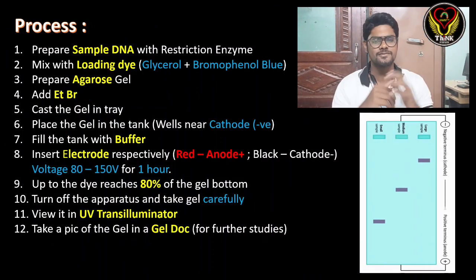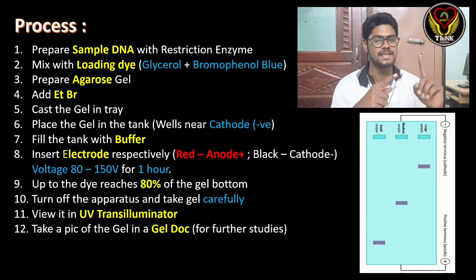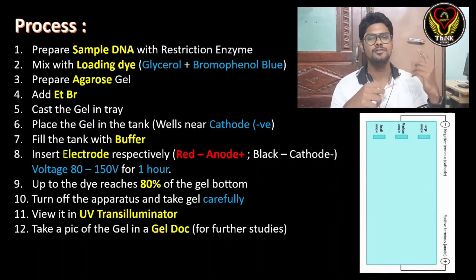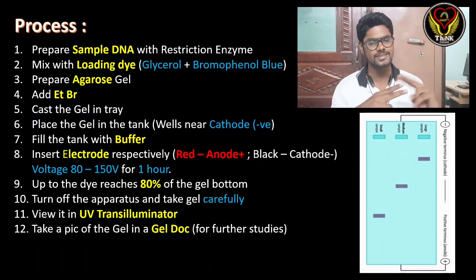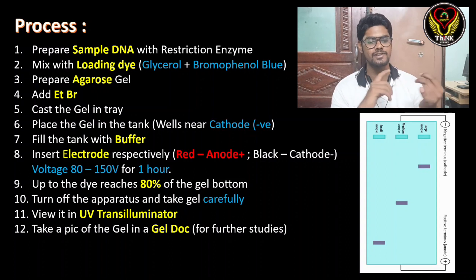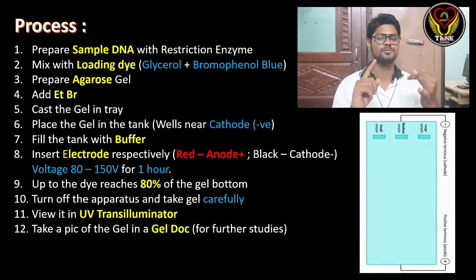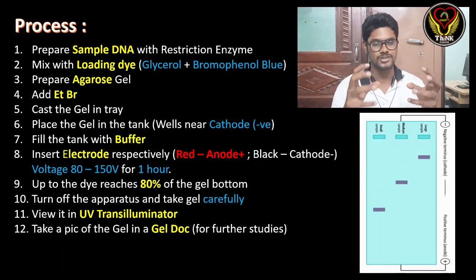So coming to the procedure of this technique, we can separate it into 12 simple steps. First is preparation of the sample DNA with restriction enzyme. With the restriction enzyme, we cut the sample DNA into small pieces. The second thing is to mix this sample DNA with the loading dye. In the loading dye, we will have glycerol plus bromophenol blue. We already know the function of both of these from the materials required step.